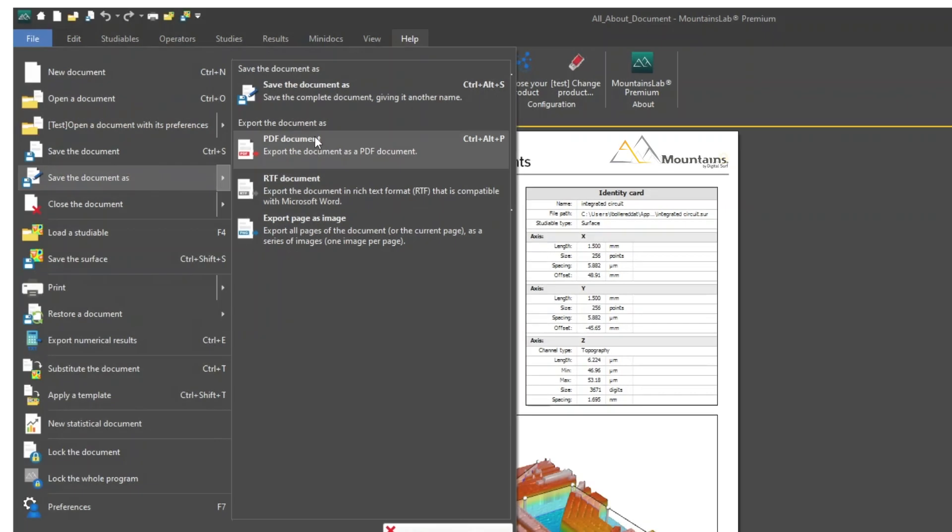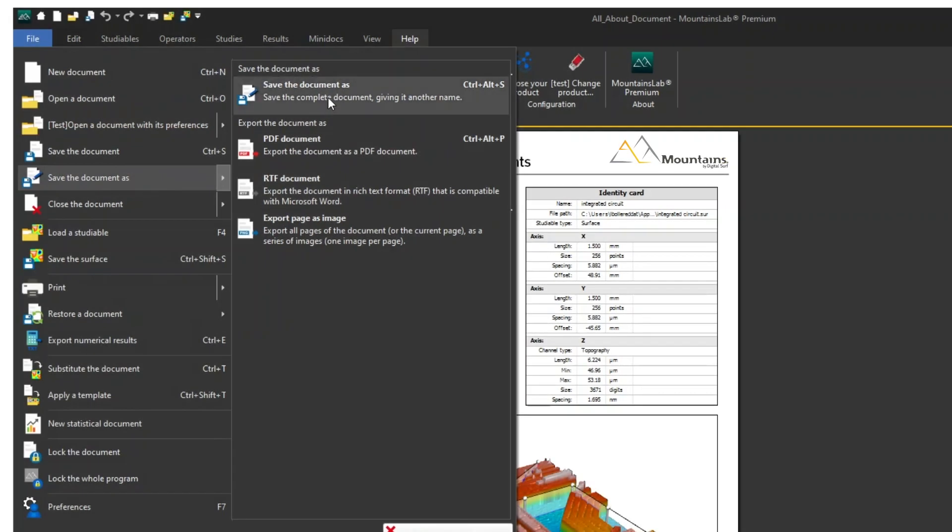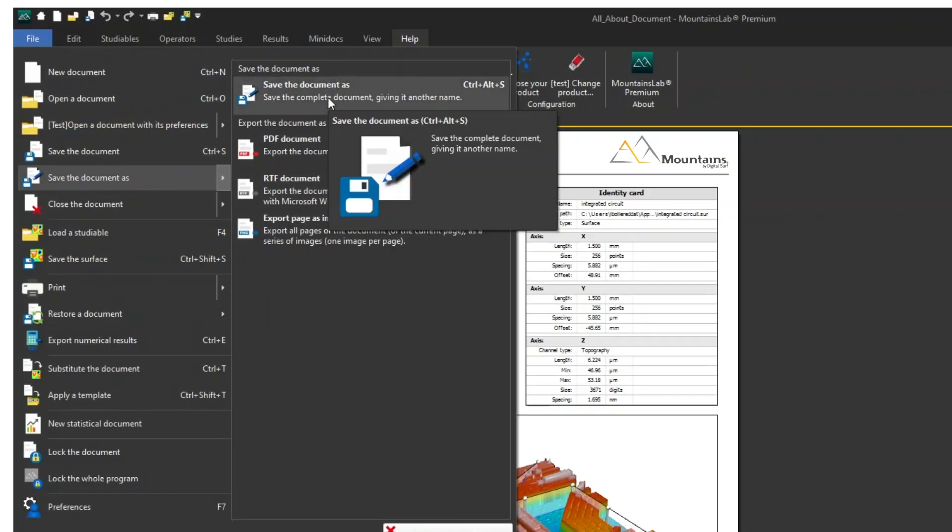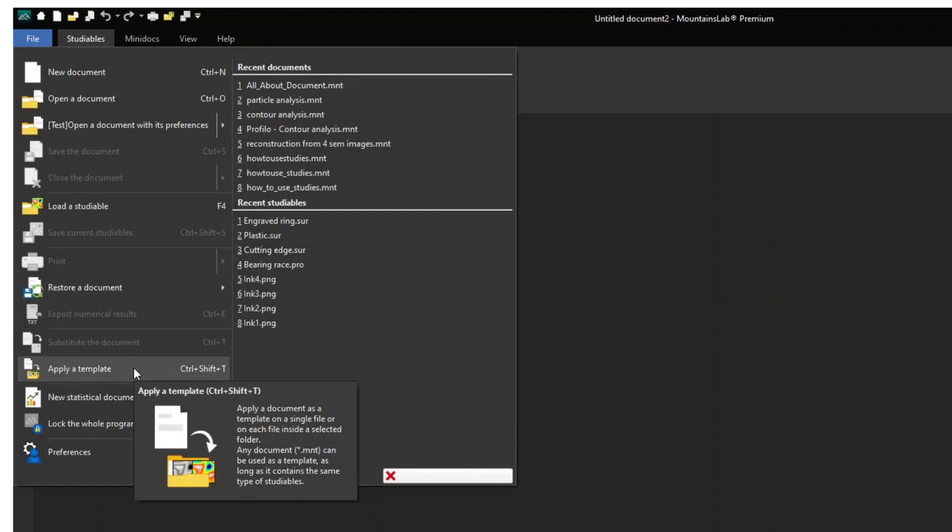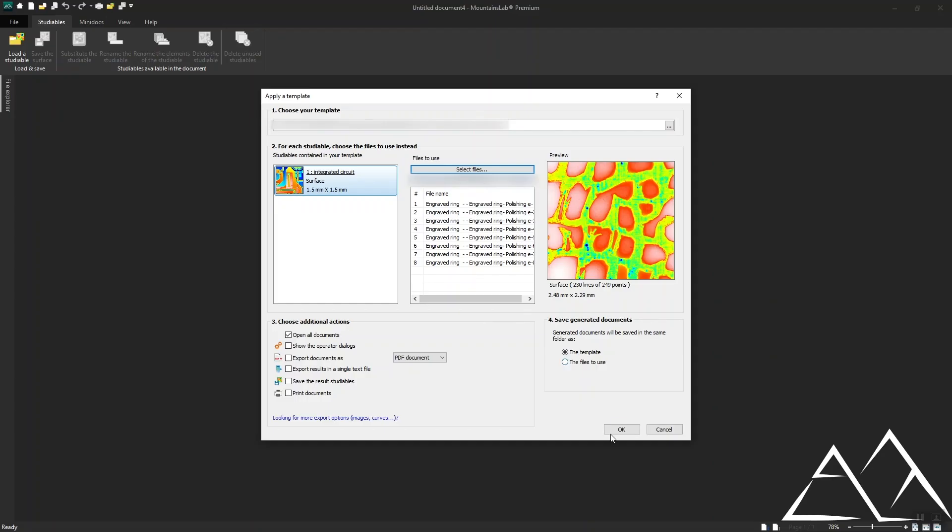Simply save the document as an MNT file, then go to File, Apply a Template, then select the document and the studyables you'd like to use.